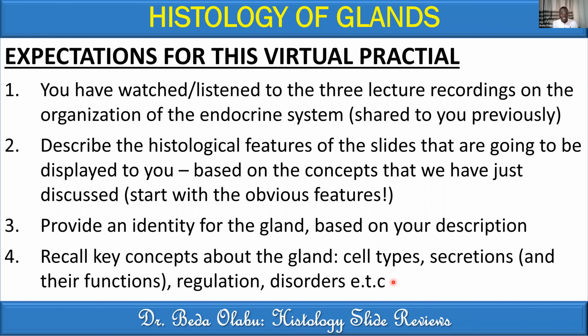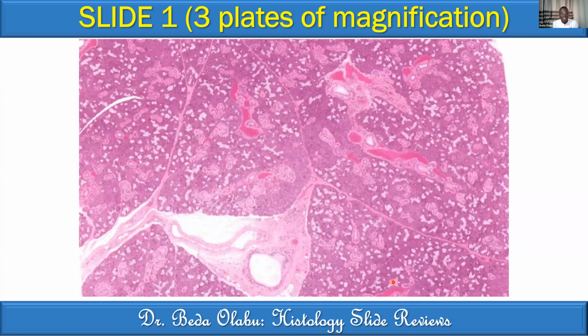So with that in mind, I'm giving you the first slide being projected there. I'm calling it slide 1. There are 3 levels of magnification I'm going to give you. I'm calling them plates for the sake of this particular lecture. So let's understand, when I talk of plates, I just mean the number of slides in that one slide. It's the same structure, but now different magnification levels. I've just called them plates.